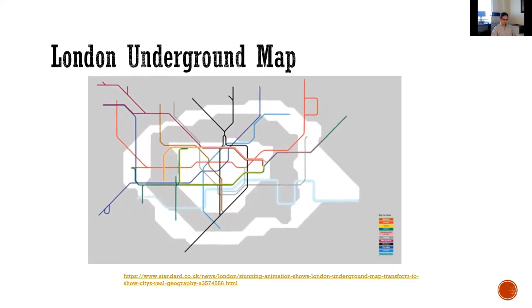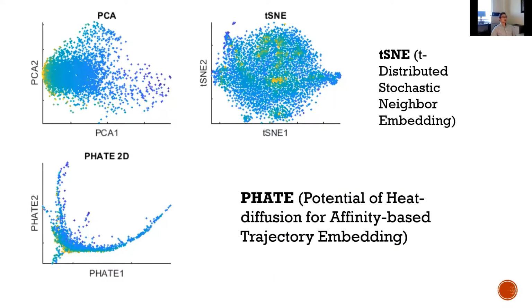Okay. So again, to show you the difference, you have a super crowded cloud of data points, cells that cannot be separated by PCA, but they are much better embedded independently and more spread out by tSNE. So tSNE is one of the most commonly used approaches to visualize your single-cell RNA-seq data.